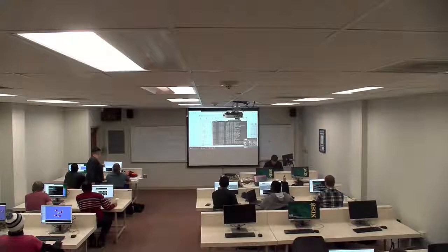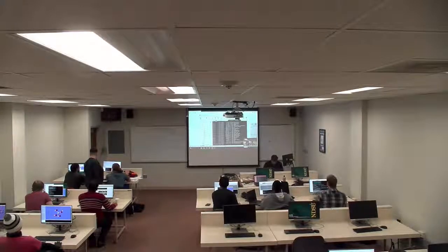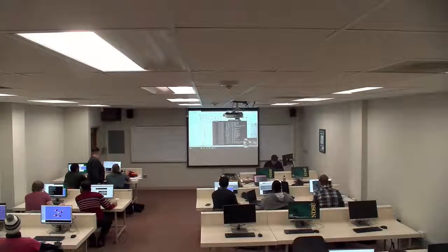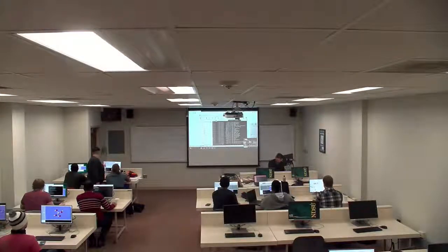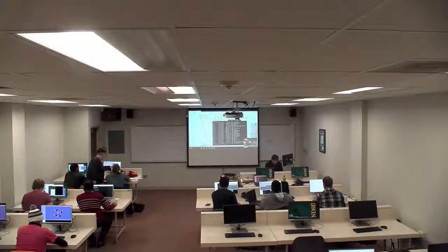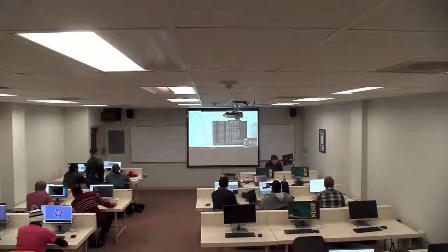Go into job type, just to make sure. Job type, yeah, you did. Method, everything is good. Why is it something else? What do you have here? Something isn't right there. You have the wrong element. You need titanium. Titanium is going to be right here.